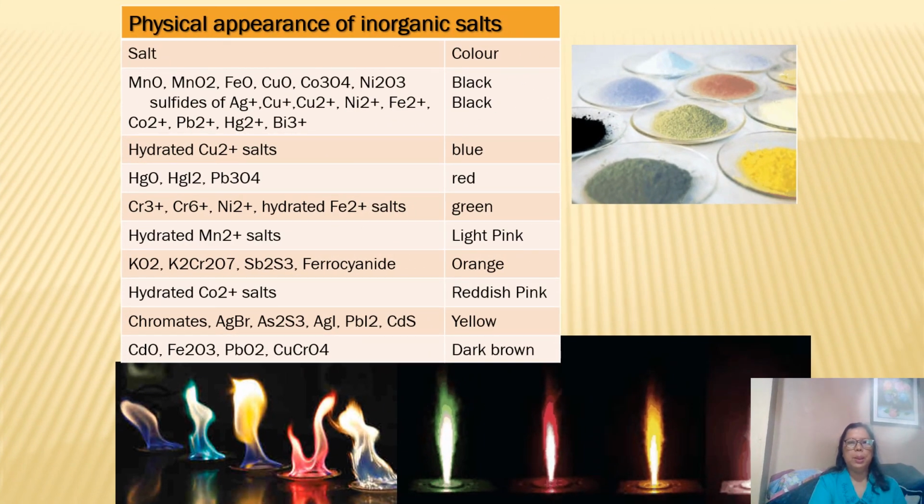These are the physical appearances of elements that are tested for flame tests. These are watch glasses, and these are also special burners to test for flame tests.